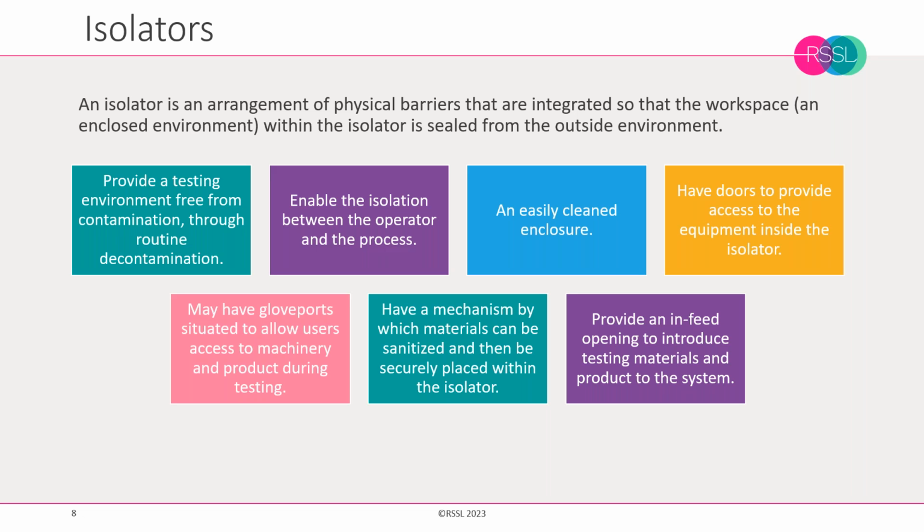So there's also means to get things sometimes inside and out of the isolator without breaching the isolator environment. Isolators will have the operator interaction through glove ports, or if they're very sophisticated, they will have done away with glove ports entirely and just consist of robotics and automation.